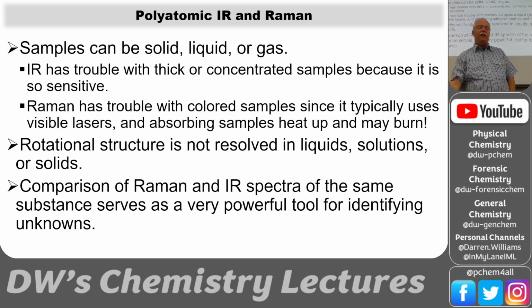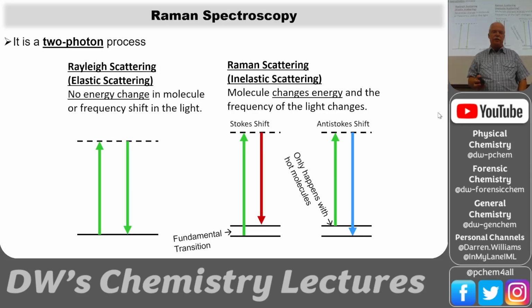So forensically, now Raman's really coming into play, and we'll talk about Raman in just a minute. So let's jump into this. Here's the Raman spectroscopy. It's a 2-photon process. We have the Rayleigh scattering and then the Raman scattering.